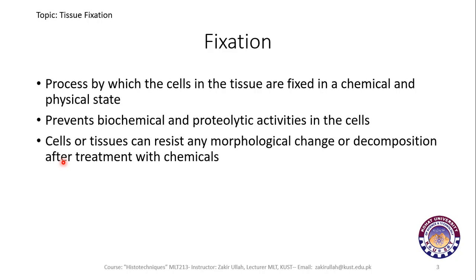During fixation, the tissue or the cells are made resistant to any sort of change, either morphological change or decomposition, because when we treat these tissues with fixatives, then afterwards when other chemicals, which are usually corrosive, are poured on the tissue or make contact with it, the tissue resists any type of morphological, biological or proteolytic change.